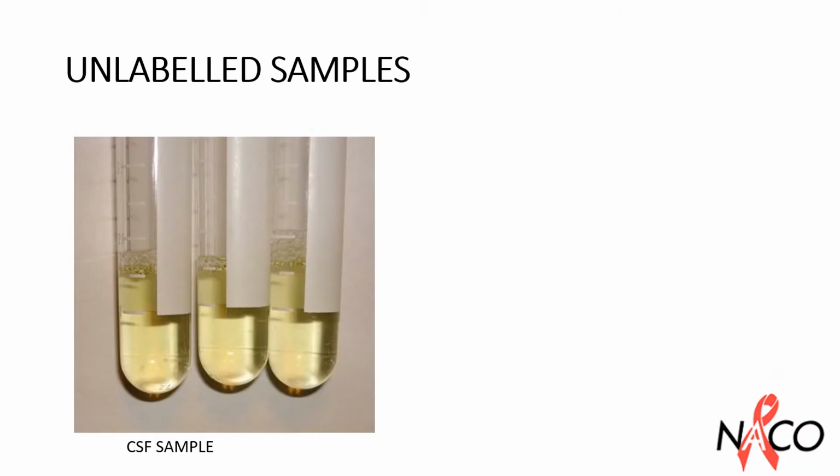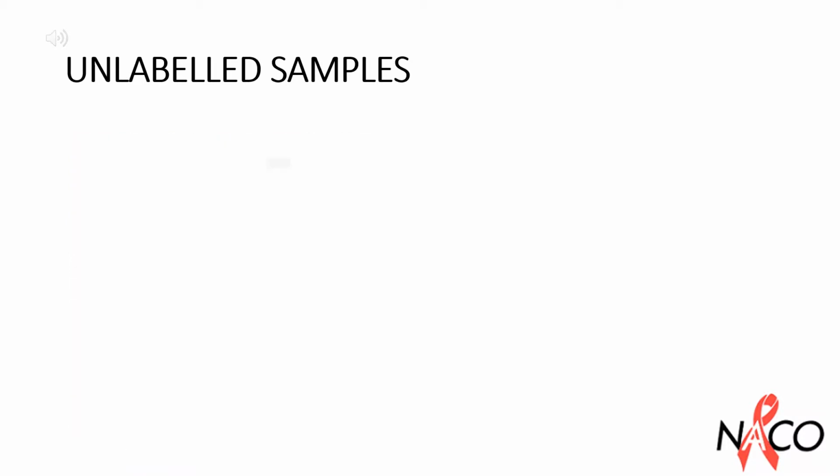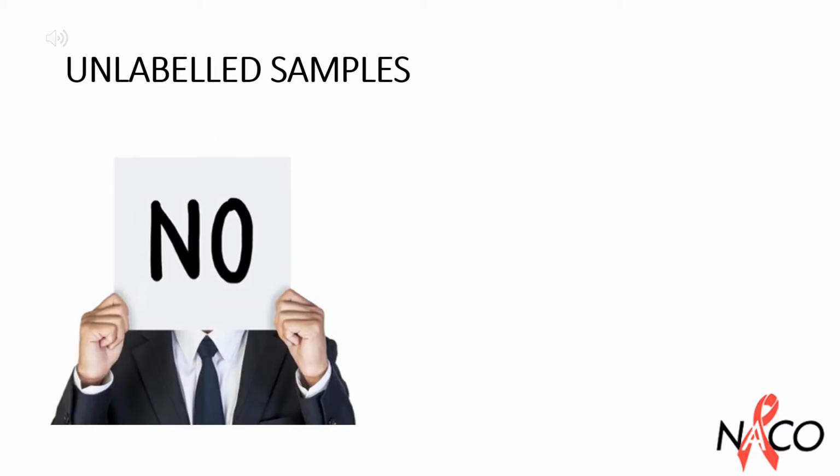Case 2. If the laboratory receives a CSF specimen in an unlabeled container, should the laboratory reject the specimen? The answer is no. The specimen of CSF should not be rejected by the laboratory straight away.